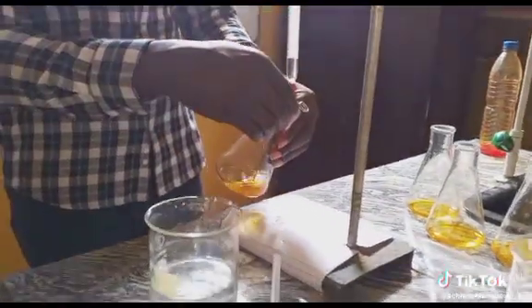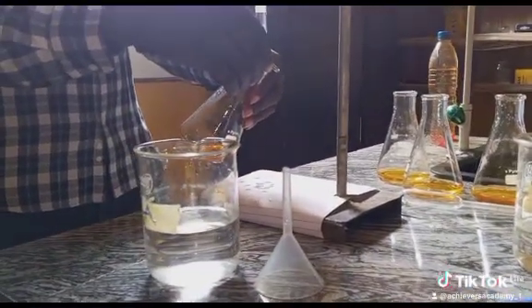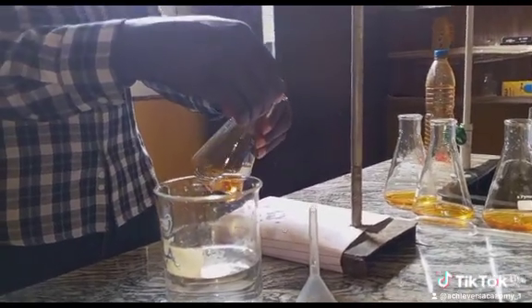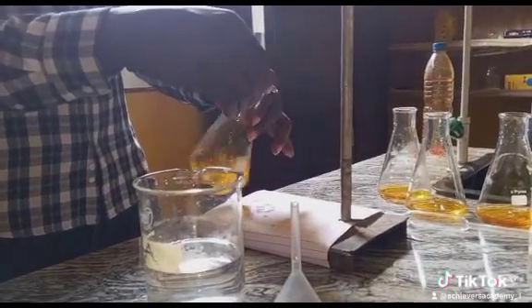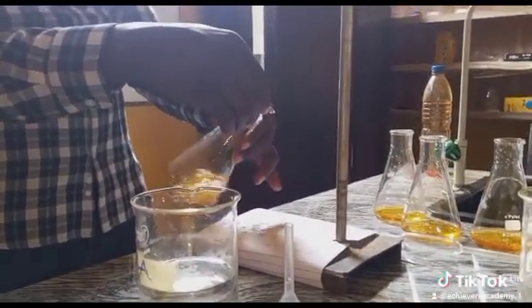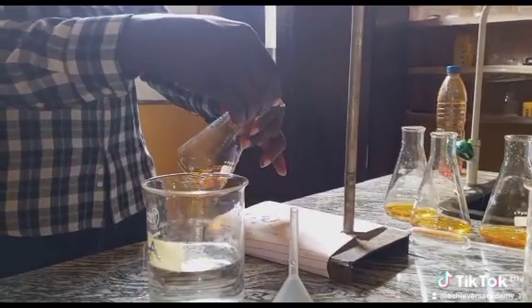And please make sure that the acid is not dropped on the body of the conical flask. It goes directly to the solution. And don't run it like a tap. If not, you will over titrate it.